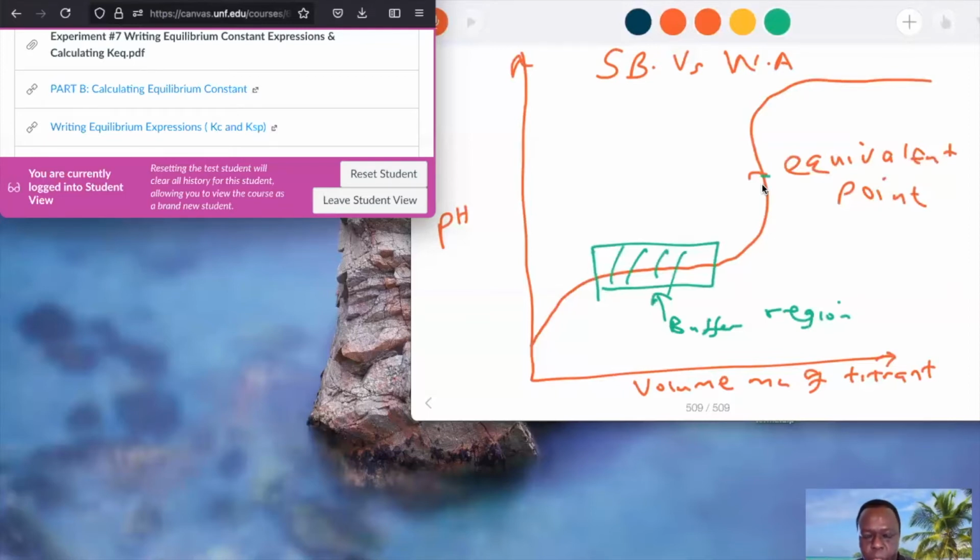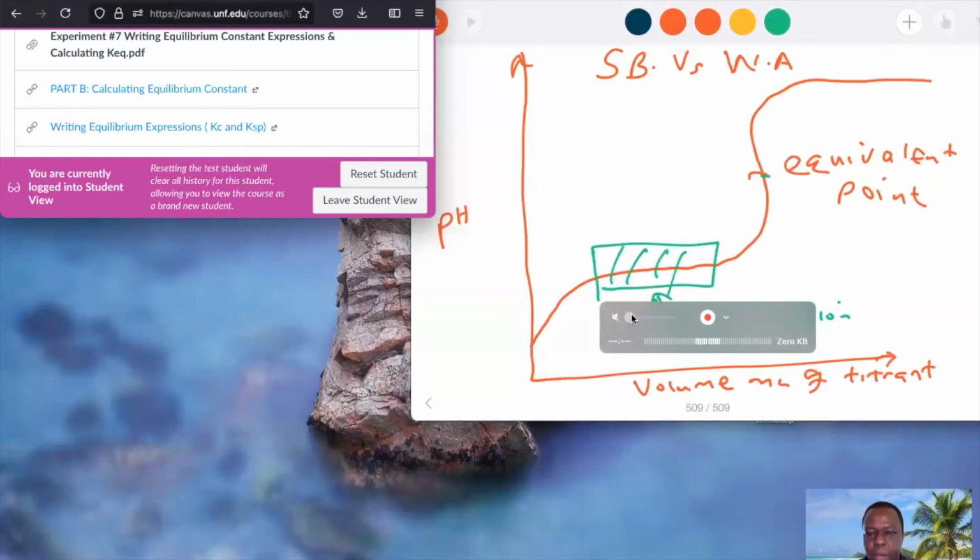If we know the equivalence point, we can perform the titration today using the simulation, not working with the chemical reagent. If you were to come to the lab, we would physically fill the burette, perform the titration, go home and generate this graph, but we will electronically generate the titration curve for a strong base, which will go in the burette, and a weak acid, which will be our analyte. You look at this region: it's going to rise gradually and then flatten out. It's not going to go the way we saw in strong base, strong acid.